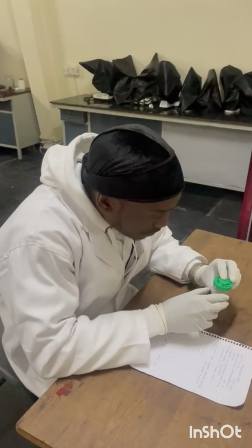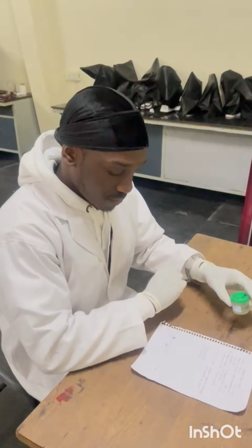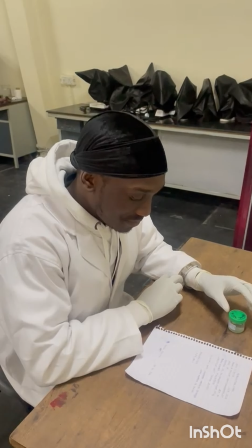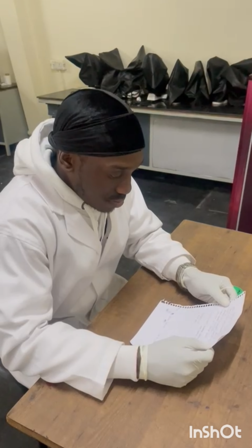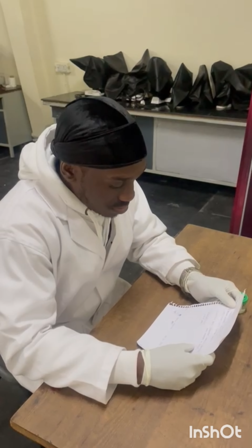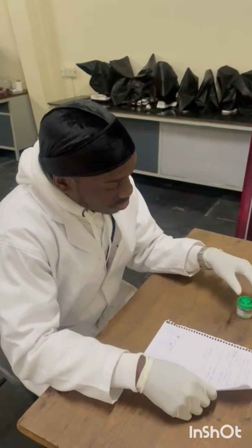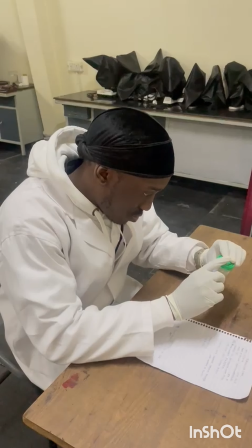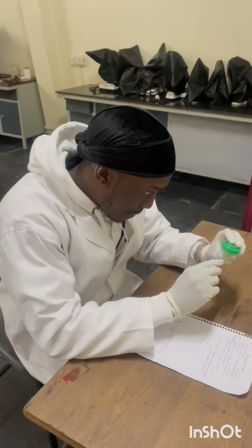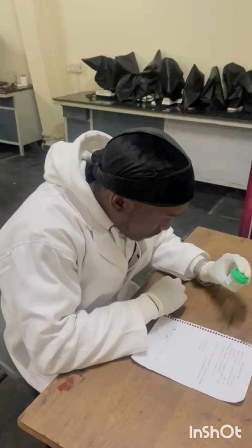Implications of improper sample reception. 1. Diagnostic errors. Incorrect or incomplete information can lead to diagnostic errors and misdiagnosis. 2. Patient safety risk. Improper sample handling or identification can compromise patient safety, leading to inappropriate treatment or delayed treatment. 3. Laboratory errors. Inaccurate or incomplete sample documentation can lead to laboratory errors, including incorrect test results or reporting.